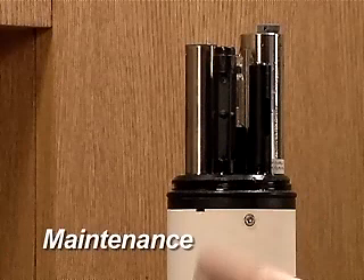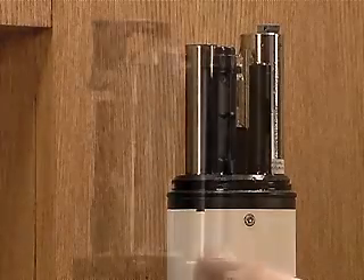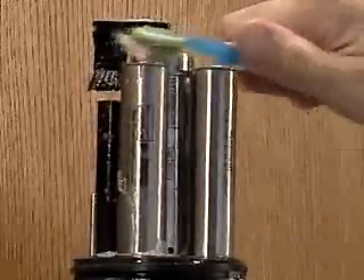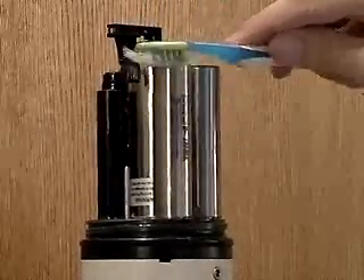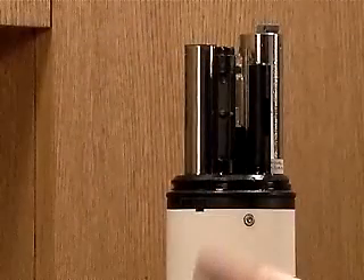The Hach LDO probe is nearly maintenance-free. To ensure accurate readings and a long sensor life, the probe should be kept clean. After each deployment, the sensor should be cleaned with a cotton swab or soft brush and soapy water to remove any oils or organisms. Organisms living on the sensor will consume or produce oxygen and change the readings.